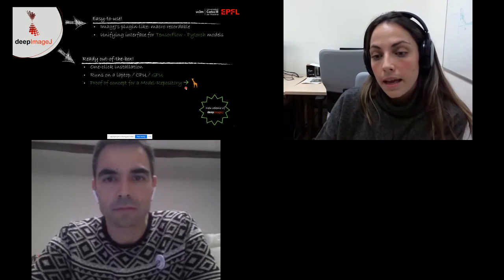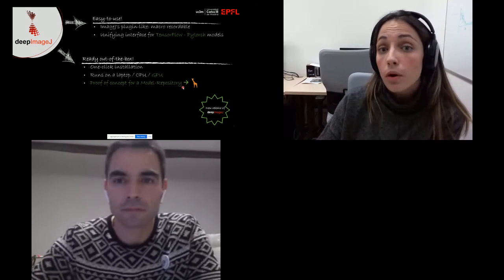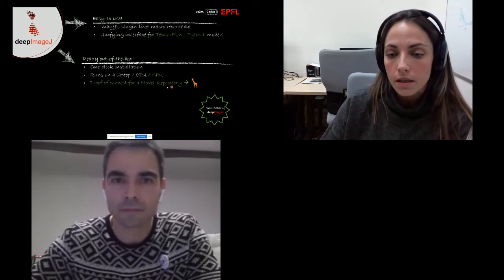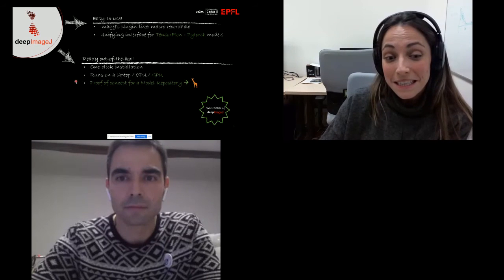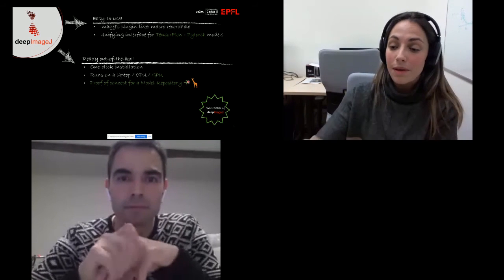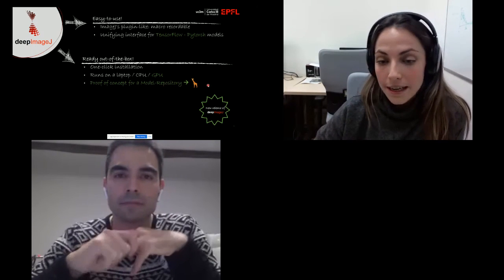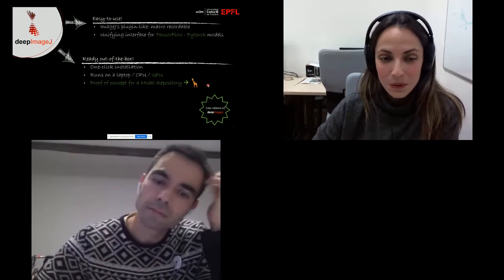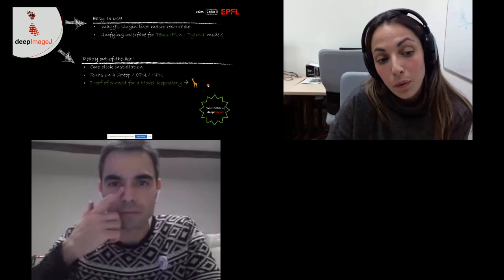And I can upload my model so you can try it, and then we can, I don't know, train it again, or I can share my models with my collaborators through the online page. And the nice thing is that this was a proof of concept, and now we have BioImage models too, that I will tell you about later on.